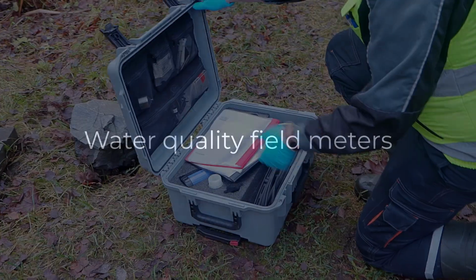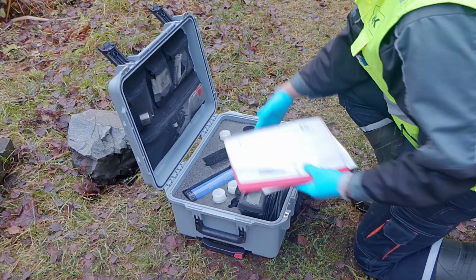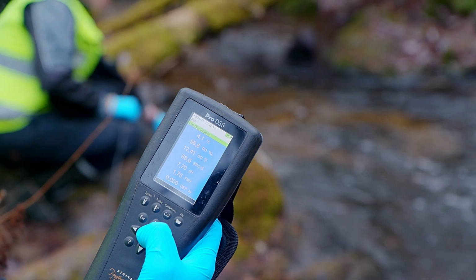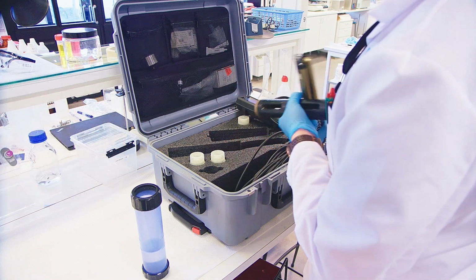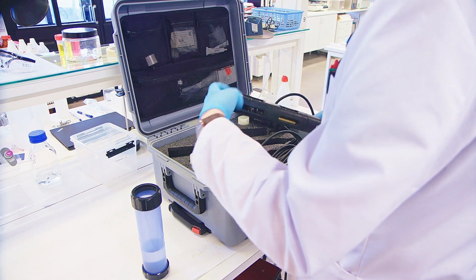Meters provide measurements directly from a measurement point without sampling and laboratory analysis. Meters have sensors that are designed to detect a particular water quality parameter. The sensors can be, for example, optical, electrochemical, or potentiometric. There are several different meter and sensor assemblies, and their suitability for the target site should always be considered case by case. When using field meters, a single measurement usually takes only minutes or a few dozen seconds.